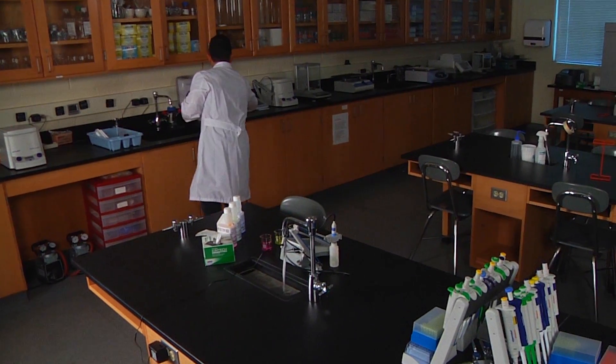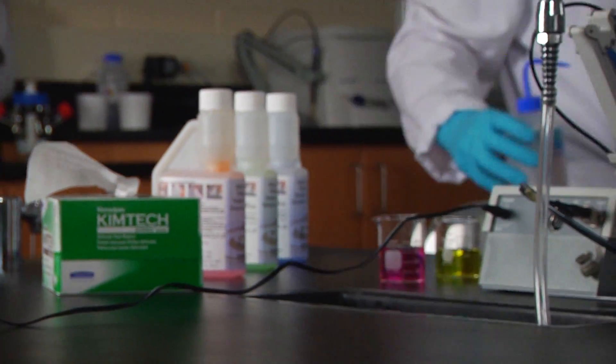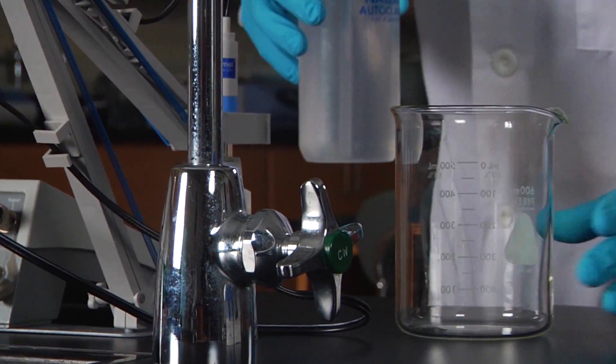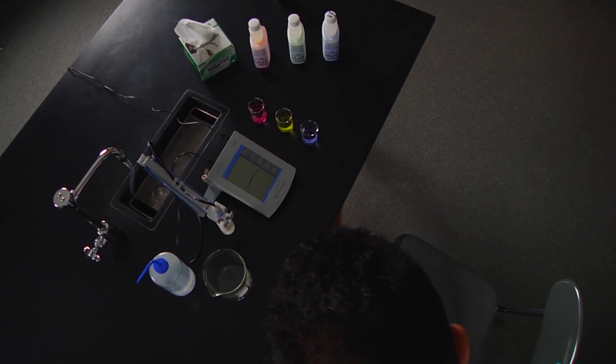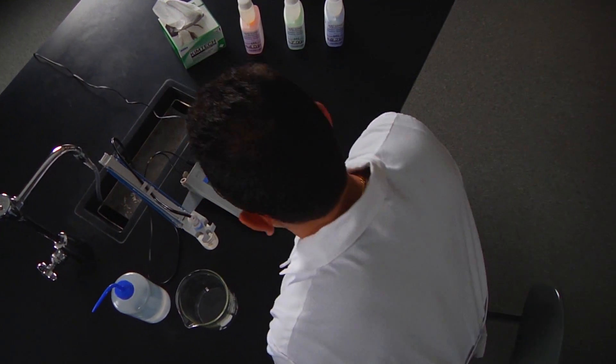The pH meter is an important lab instrument used for measuring the acidity or alkalinity of a liquid. It must be calibrated before each use to ensure accurate readings. Let's do a three point calibration.